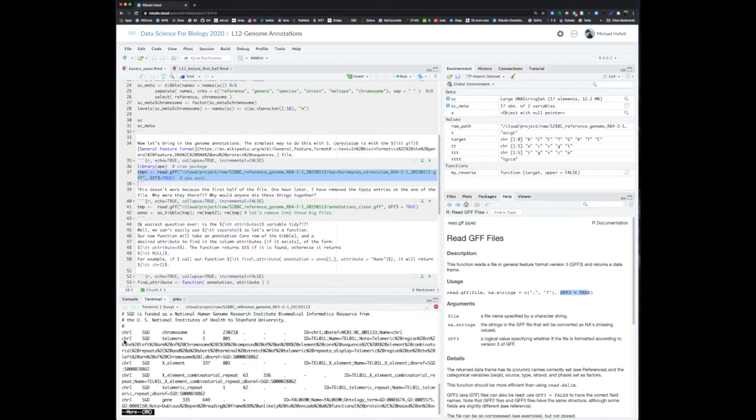And then the second event is also on chromosome 1. It's just saying from base 1 to 801, it's a telomere. And then it gives some information about that telomere. It's unreadable here, but that's okay. And then there's an X element. I don't even know what an X element is. I think it's a repeat. It's from 337 to 801.